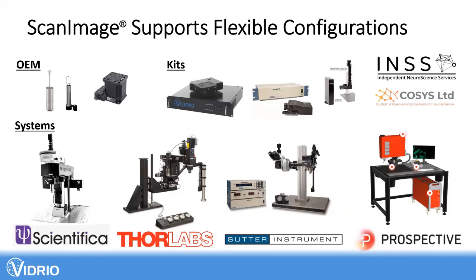You can go from kits; there are several companies that offer kits. You can work with INSS and COSYS to build a custom microscope or do it yourself. But there are also finished scopes that Scientifica and others offer.